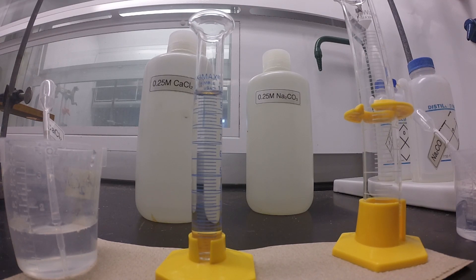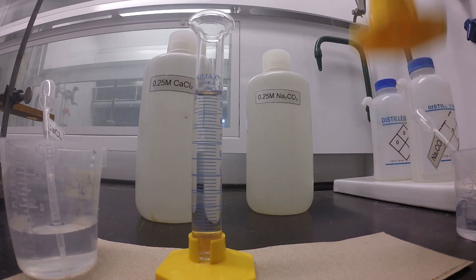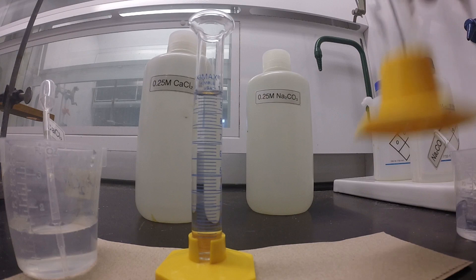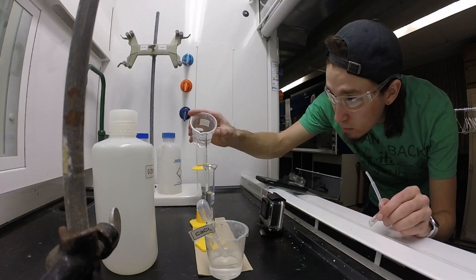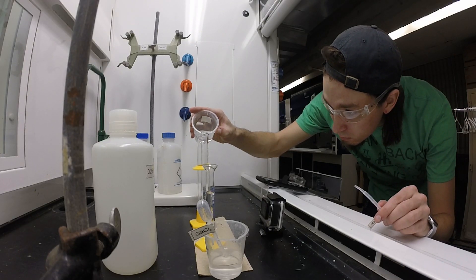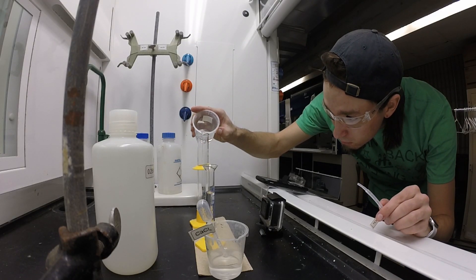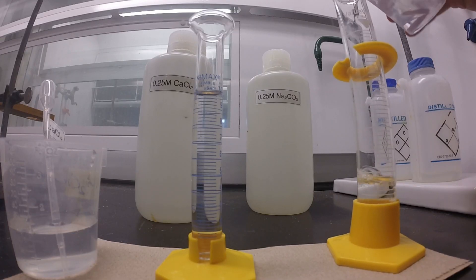We're now going to do the same thing with the sodium carbonate, except we are going to measure 15 mL of the sodium carbonate. Again, we'll do this very similarly - we're going to measure up to about 14 mL by pouring in with the beaker and then using the dropper to measure the last mL.